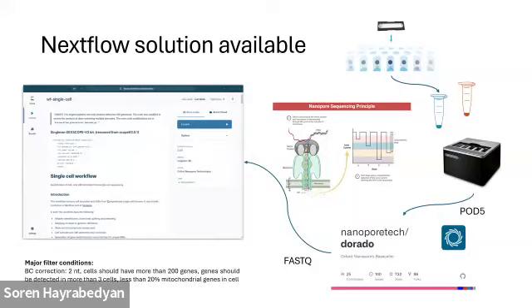And they can import this pipeline and directly analyze their data. So from FASTQ files from Dorado, they'll get a matrix file. Actually, all the files that a 10x system will produce. So they can go further to Seurat or Monocle. This is for the audience that is actually using more or less single cell sequencing.